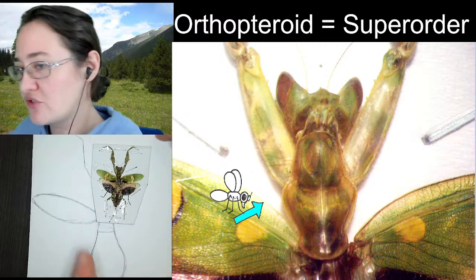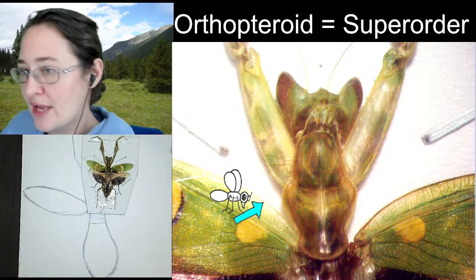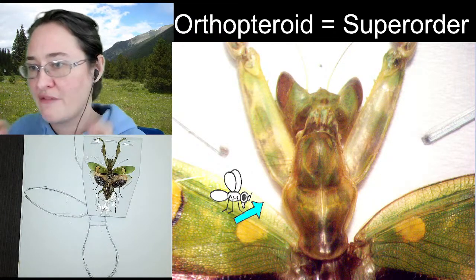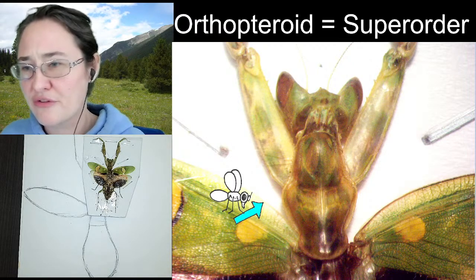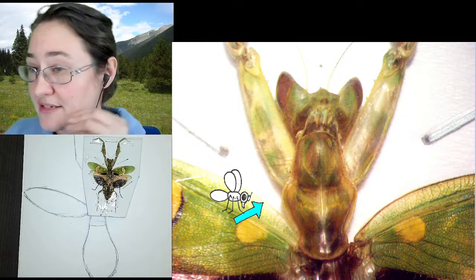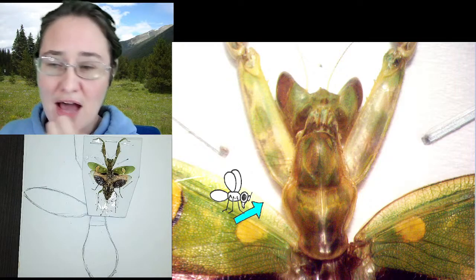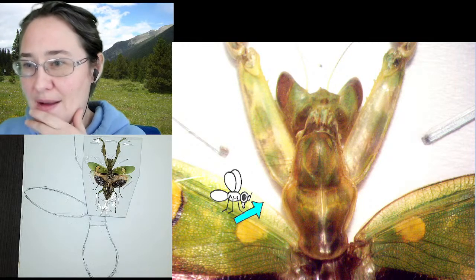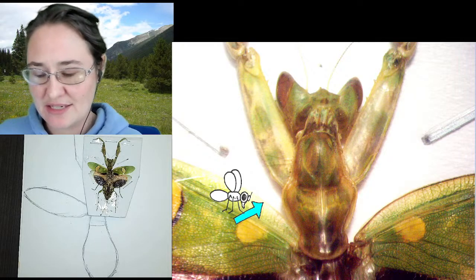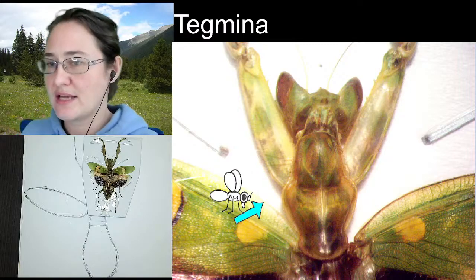They have similar characteristics in that they have cerci on the end of their abdomen, and their front pair of wings are what we call leathery front wings. These thicker leathery front wings are not as hard as the elytra of a beetle, but they are thick enough to protect the membranous wings. You'll notice, like the front wings of a grasshopper, they don't flap a lot when they're flying. They're mostly protective. And this type of leathery front wing, we call it a tegmina.